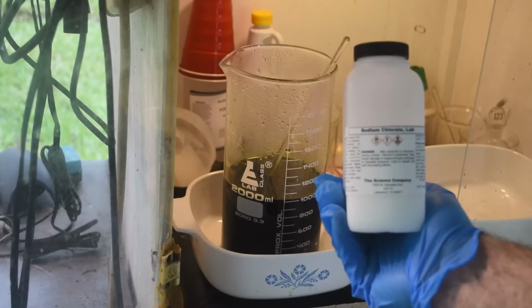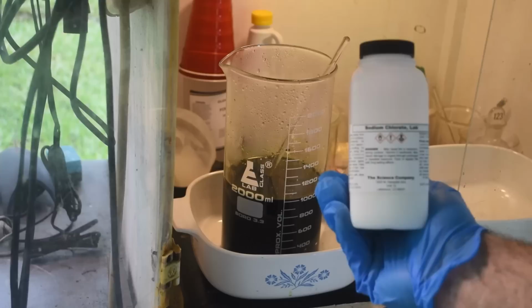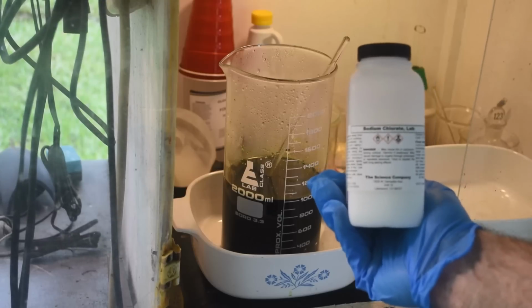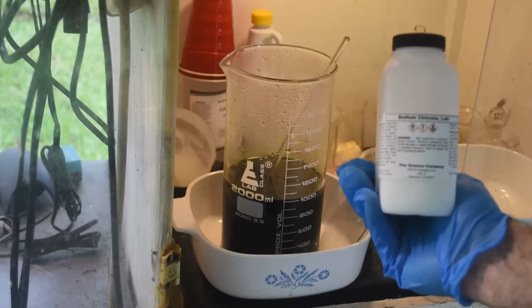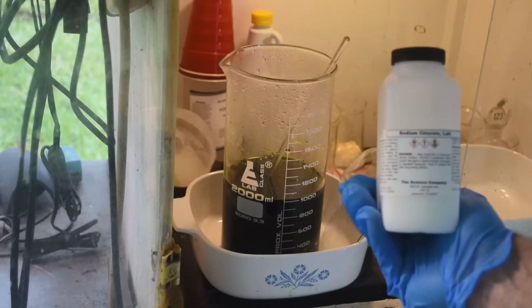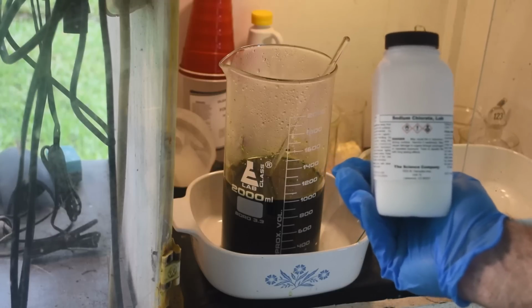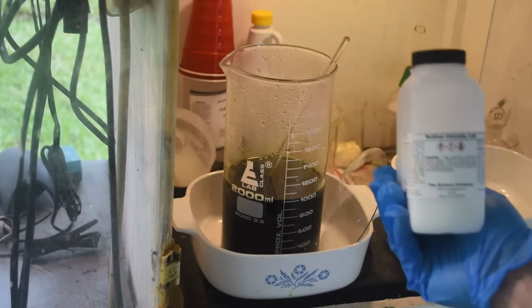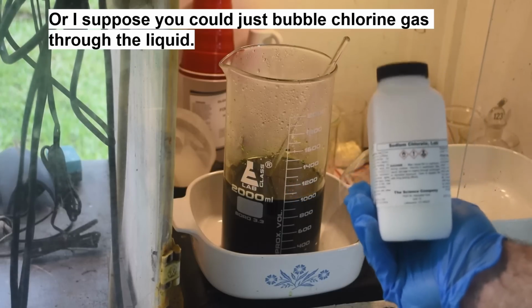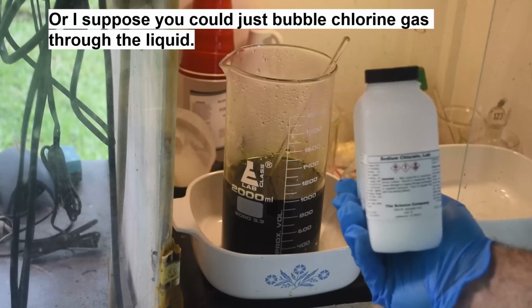That was a very popular question, and my answer is maybe. I would assume that a lot of hypochlorites would do the same thing. Sodium hypochlorite, calcium hypochlorite, they might work just as well, but I haven't tried it. That might be the subject of a future video to see if they will work better. But basically, I think anything you put in here that will generate chlorine gas ought to work as well as this stuff. But this stuff really works.